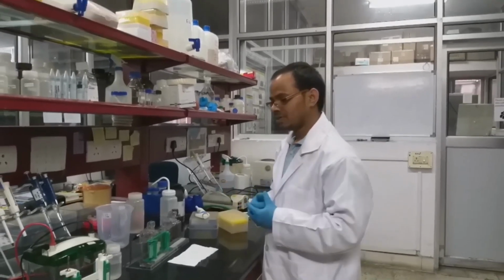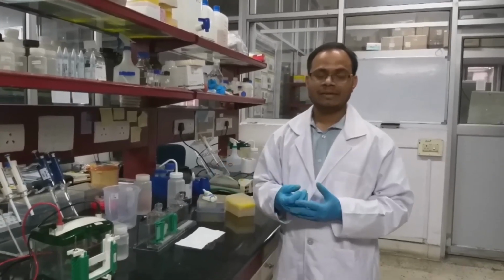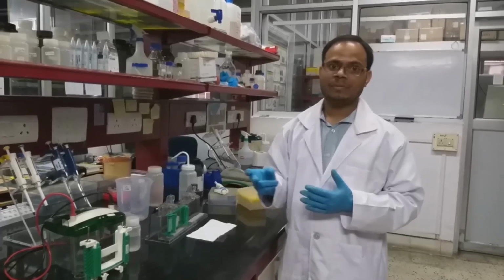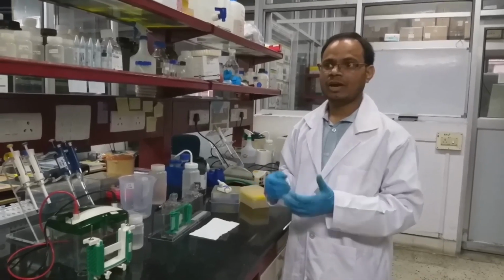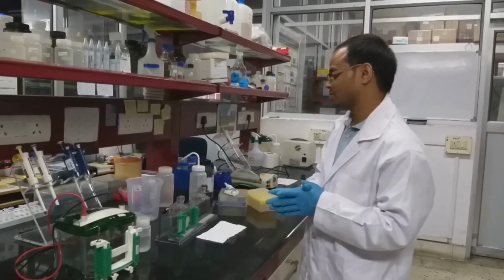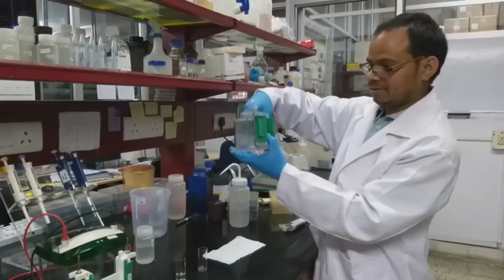So why are we doing this? Because if the gel is exposed to air, then the oxygen from the air will interfere in the polymerization of the gel. So we have to add either water or 2-butanol for this purpose. Now we have to check whether it is solidified or not.